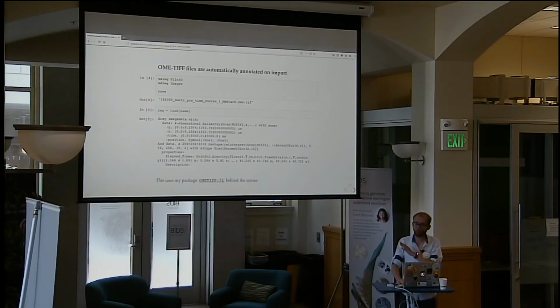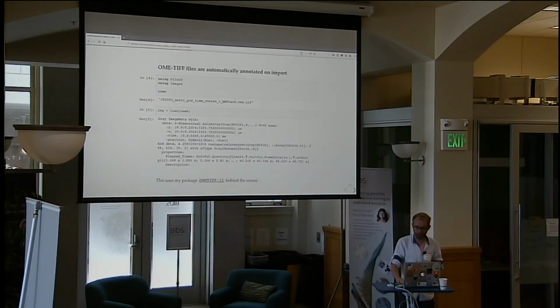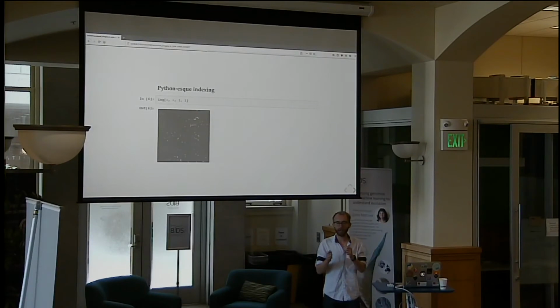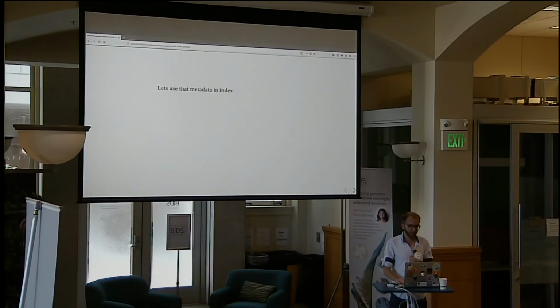There's a lot more stuff, like if you write any description files in Micromanager, that all shows up here too. You can do Python-esque, NumPy-like indexing, where Julia is one-based index. Remember it's YXTP. If we want the first time point and the first position, you can operate on it like a standard array, and you get a nice little image printed out, which is the first time slice.